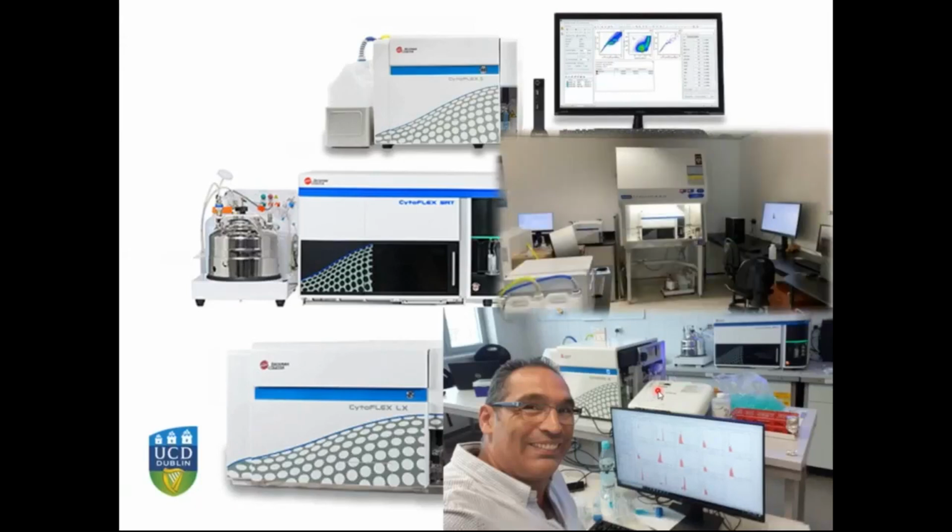So this is the situation now in the lab. We have the sorter in the biosafety cabinet, as you can see, compared to the CytoFLEX S that we have here. See how small the sorter is.